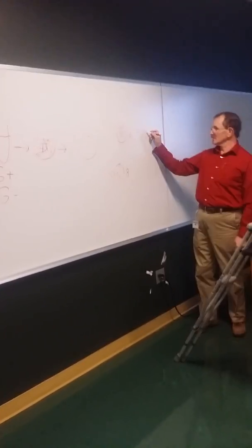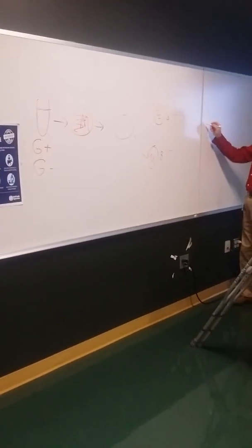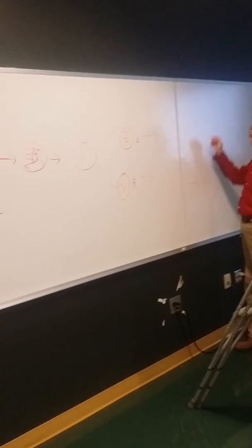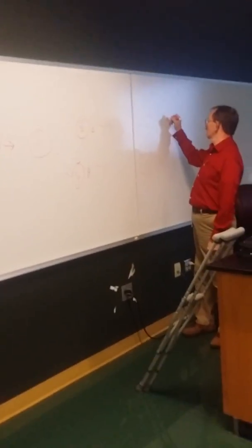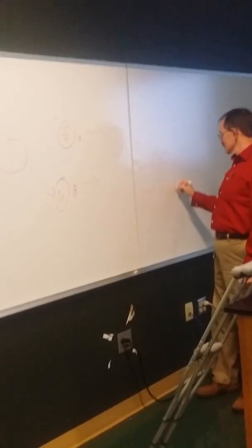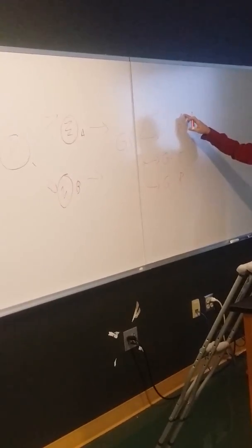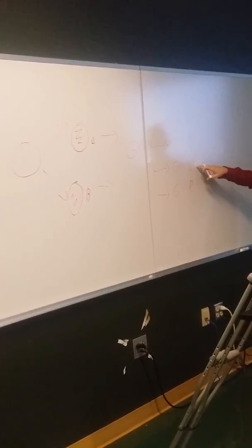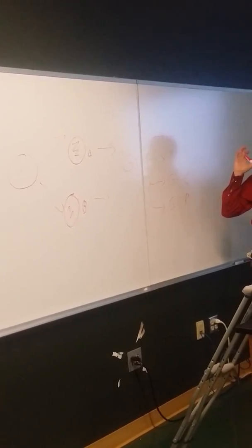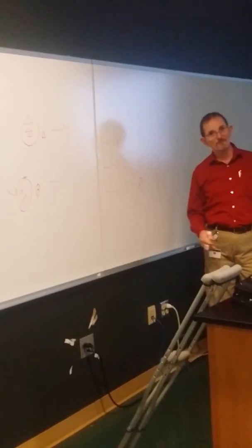Okay, from this point, gram stain. When you gram stain, you're going to come out 1 of 4. So you're going to have either a gram-positive coccus or rod, and you will have a gram-negative coccus or rod. They could both be cocci, they could both be rods, they could be any mixed match. Okay? There's no pattern to it. Take my word for it.